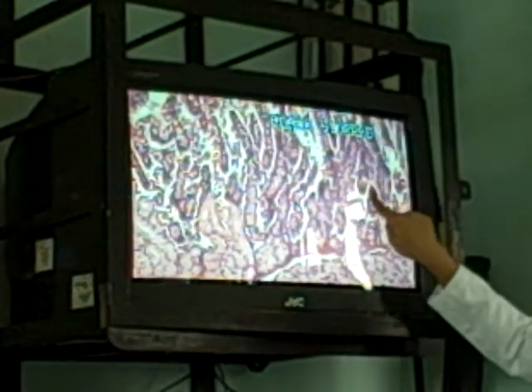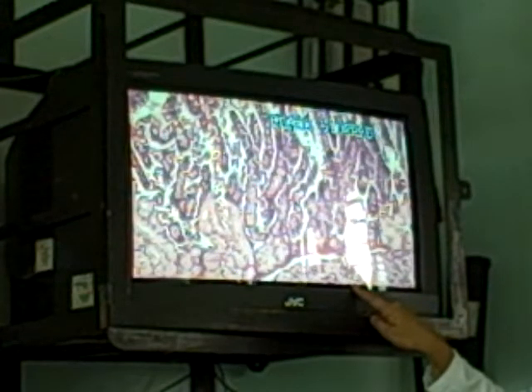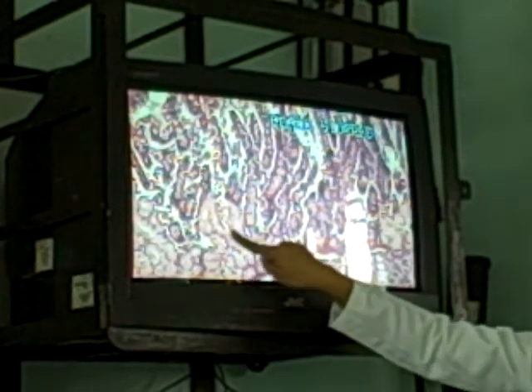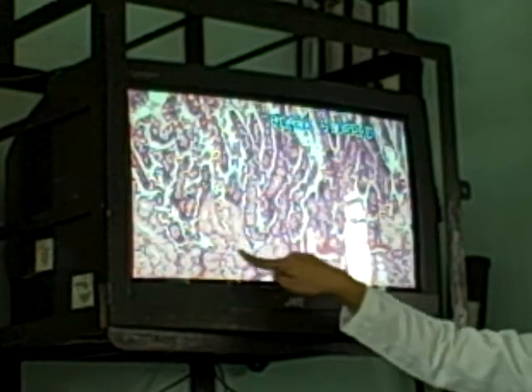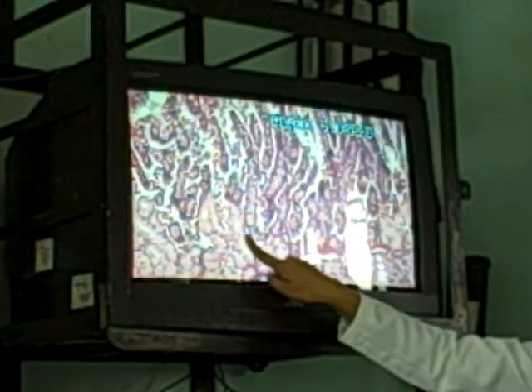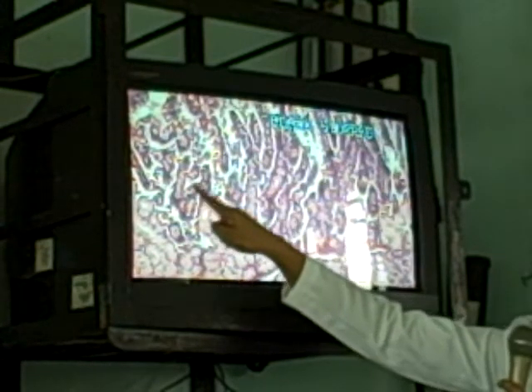Darker in color as compared to this one. These are Brunner's glands. They extend. You have them similar to the Brunner's because these are extensions of your Brunner's gland into the lamina propria. But these darker glands are actually your intestinal glands, the main occupants of your lamina propria. If you are asked about the characteristic cell, again, Paneth cell.